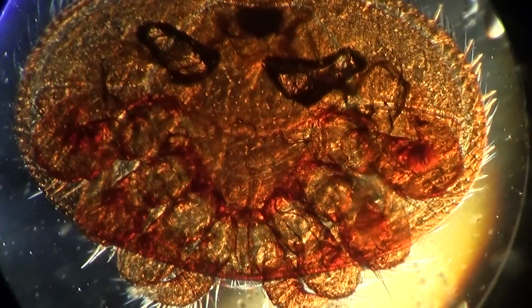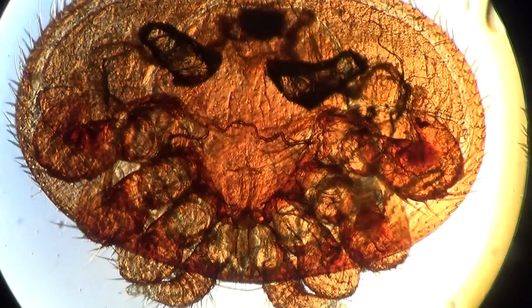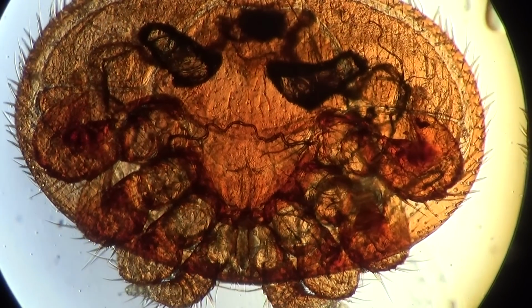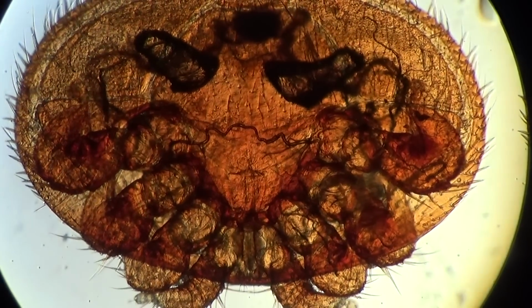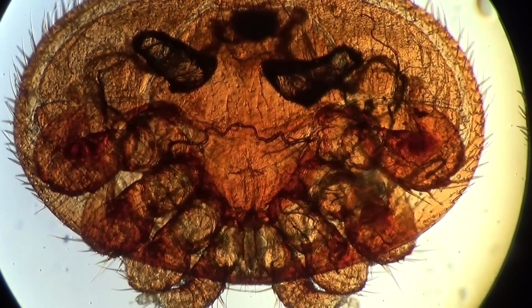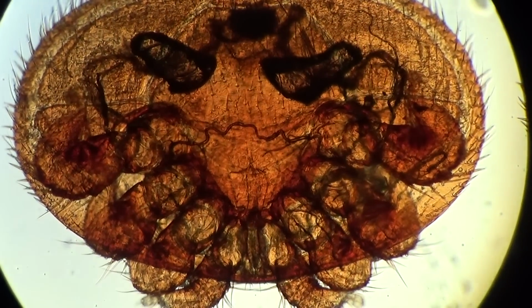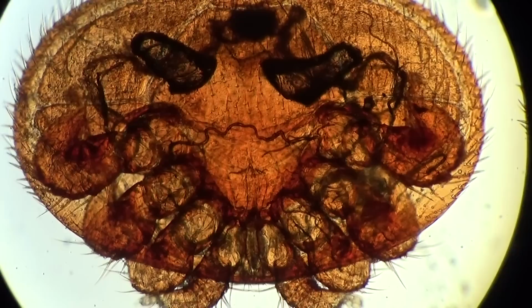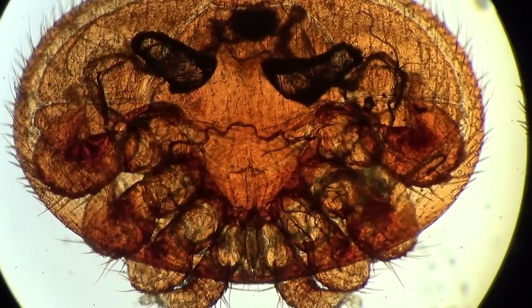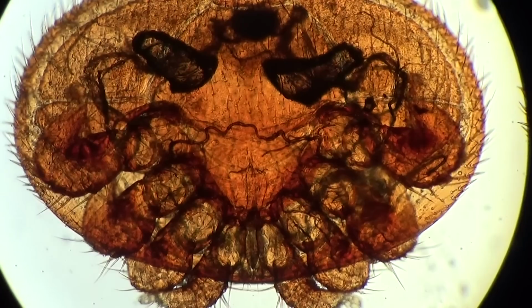Inside a honeybee cell, up to 12 or even 20 mites can be developing. These mites are resistant to cold temperatures, but do not develop during the winter. They develop mostly in spring-summer time on the brood of honeybees. And the most preferable brood is the drone brood.